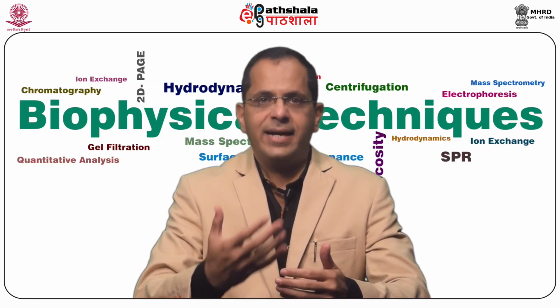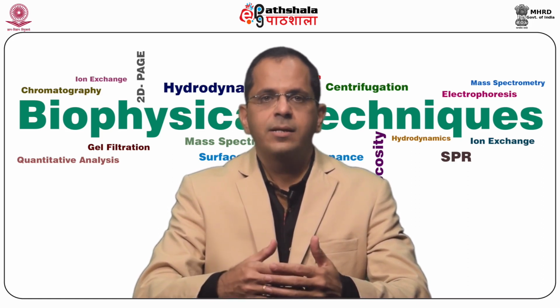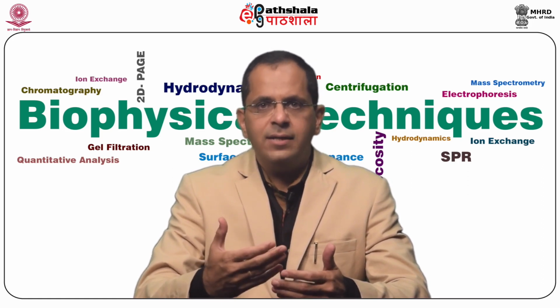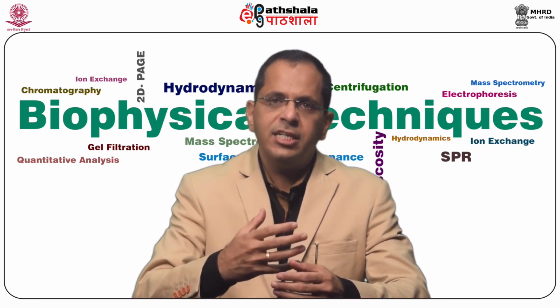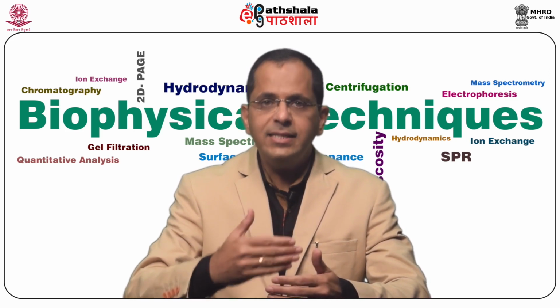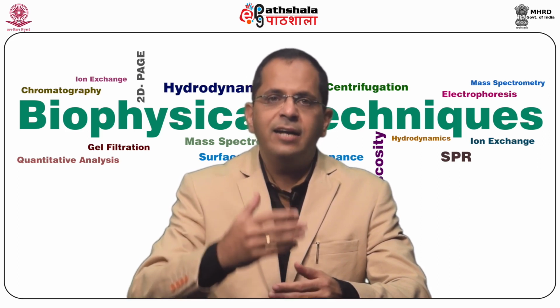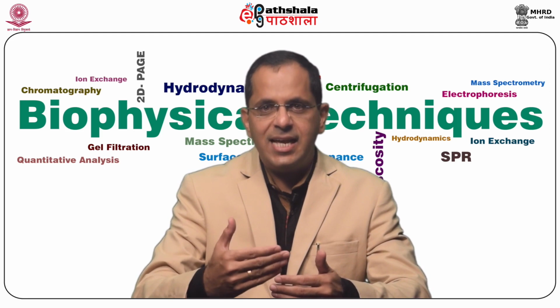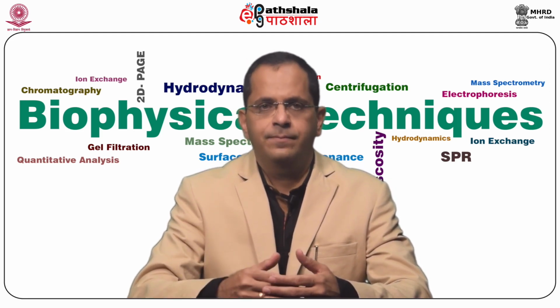So, what are all the factors that affect protein stability and solubilization? Beta-mercaptoethanol or dithiothreitol disrupt the disulfide bonds that stabilize the tertiary or quaternary structure of the proteins. Heating the protein sample facilitates denaturation, and the unfolding process allows chemicals such as SDS and DTT to interact with the proteins.